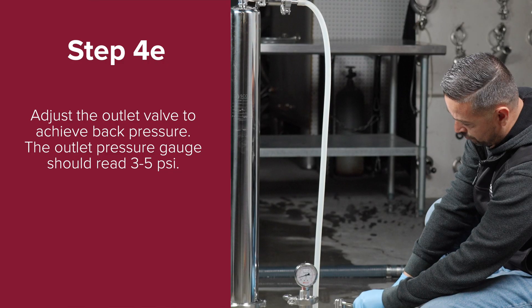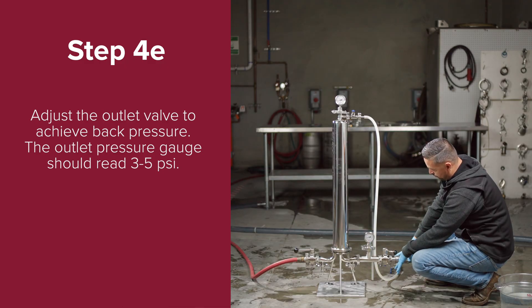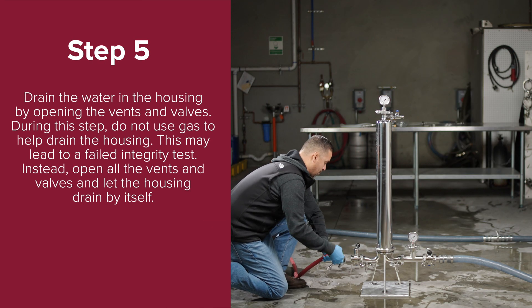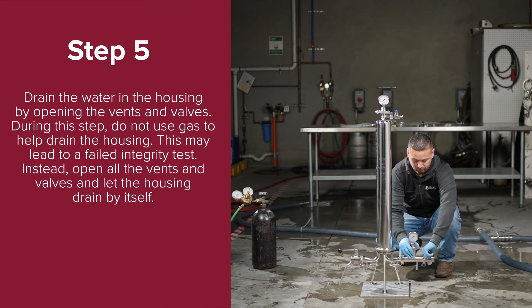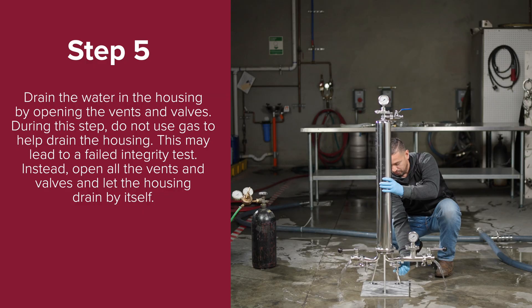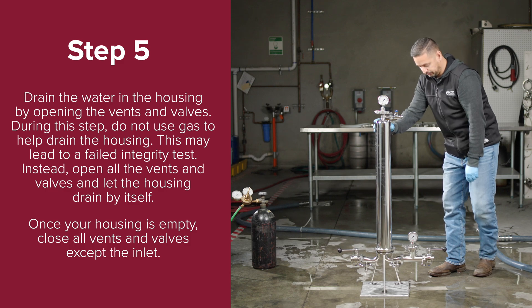Step 4e: adjust the outlet valve to achieve back pressure — the outlet pressure gauge should read 3–5 psi. Step 4f: continue running water through the housing under back pressure for 10–15 minutes. During this process, open and close the top vent valve two to three more times to ensure all bubbles have been purged. After 10–15 minutes, stop the pump or switch off the water source. Step five: drain the water in the housing by opening the vents and valves. Do not use gas to help drain the housing, as this may lead to a failed integrity test. Instead, open all the vents and valves and let the housing drain by itself. Once your housing is empty, close all vents and valves except the inlet.